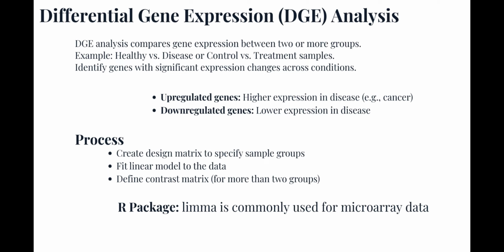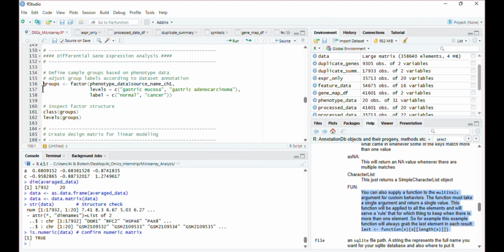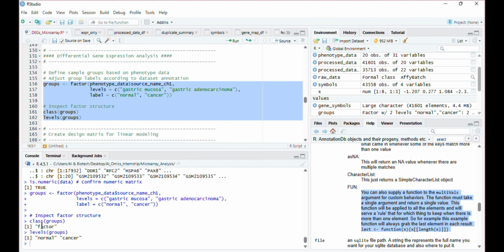In order to identify expressed genes using a linear model, we need to do two things: generate a model matrix specifying the design, and fit the model to the design. In all cases, except for the simple two-class comparison, we must also specify a contrast, which we will get to shortly. So start by defining our groups, cancer and normal. We already created a vector for group in the previous class, so we will use it here.